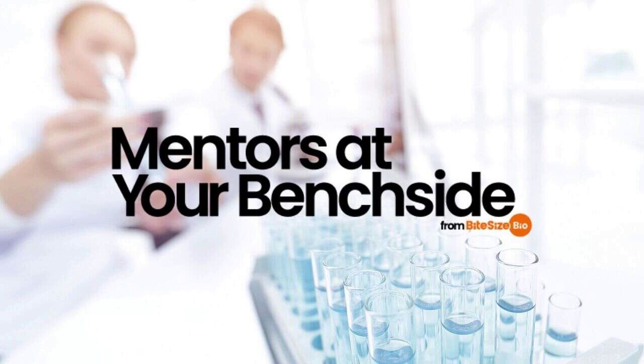Microscopy is a technique that allows us to observe rather than measure biological events and make conclusions based on what we see rather than some calculations. Sometimes, though, our observations must meet certain criteria to support our conclusions. One measurement in particular quantifies the condition crucial to so many protein research areas, protein colocalization.